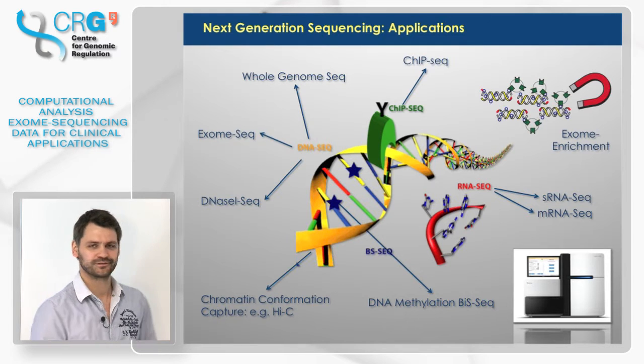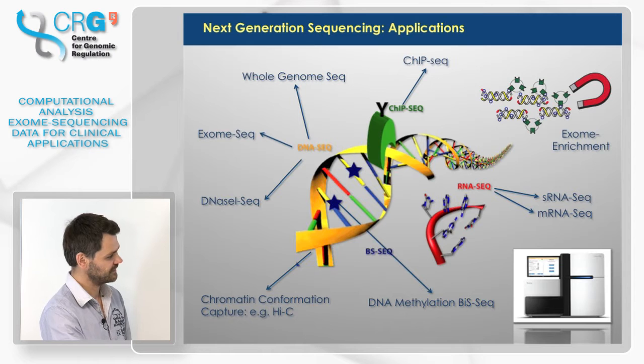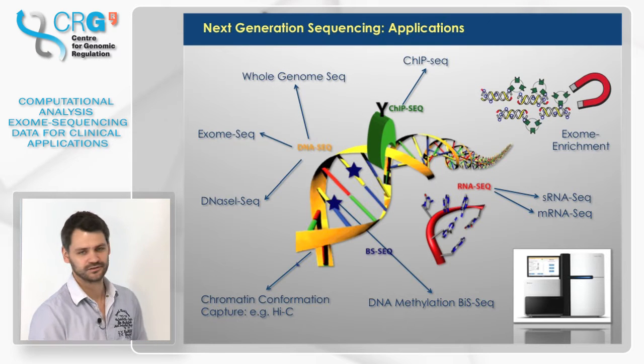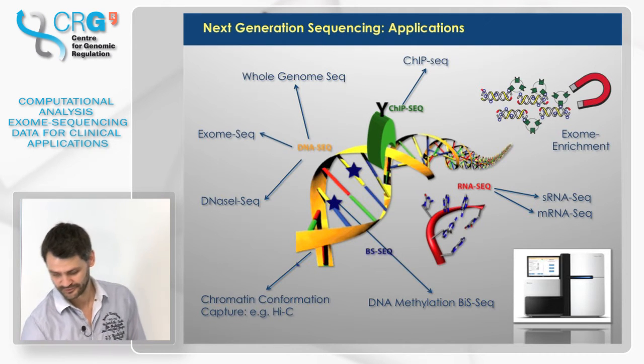In, I don't know what near future, but maybe in the next 10 years, we will also see in the clinics more and more DNA methylation sequencing, open chromatin sequencing, or protein-DNA interaction. And what's already used a lot, I guess, in clinical research at least, is transcriptome sequencing.